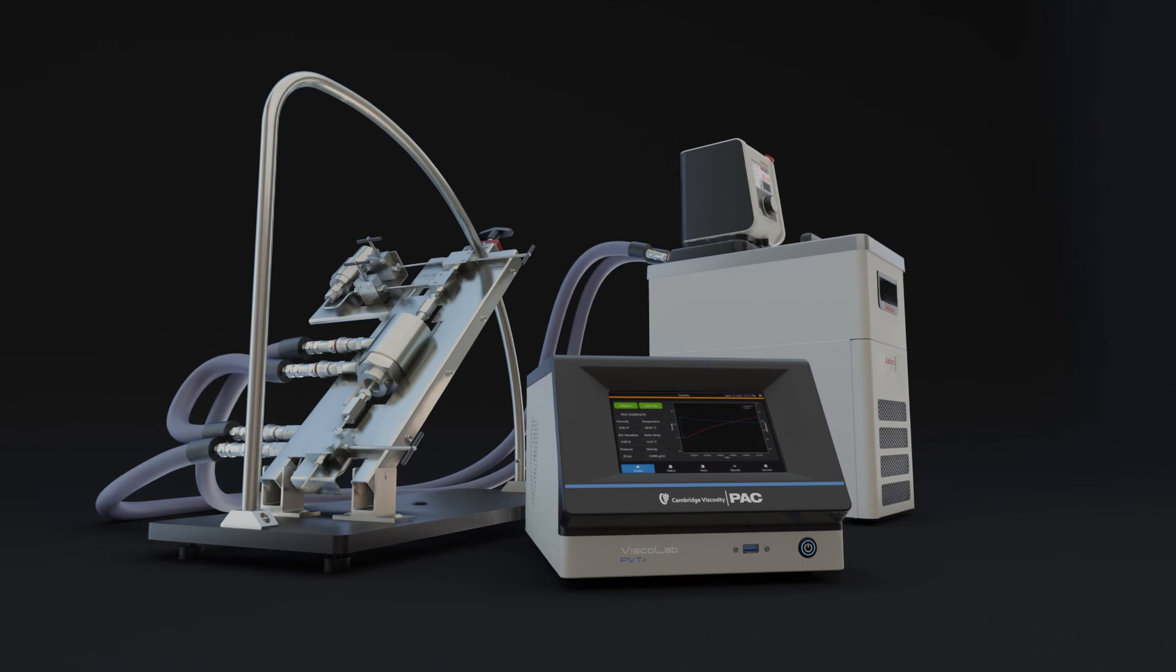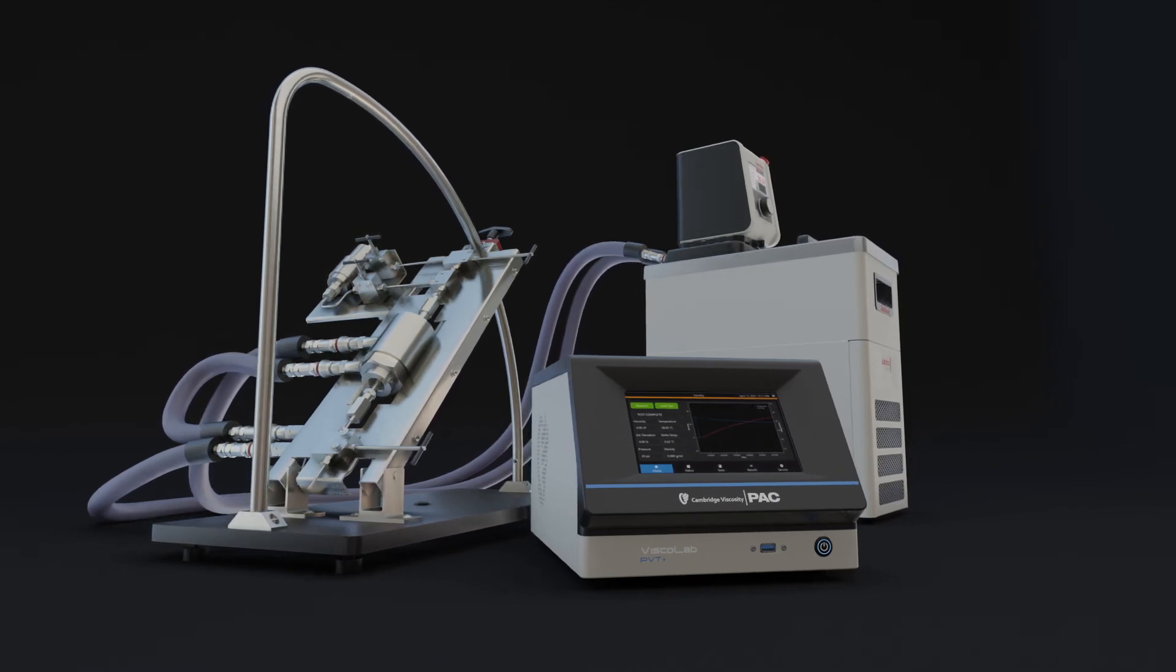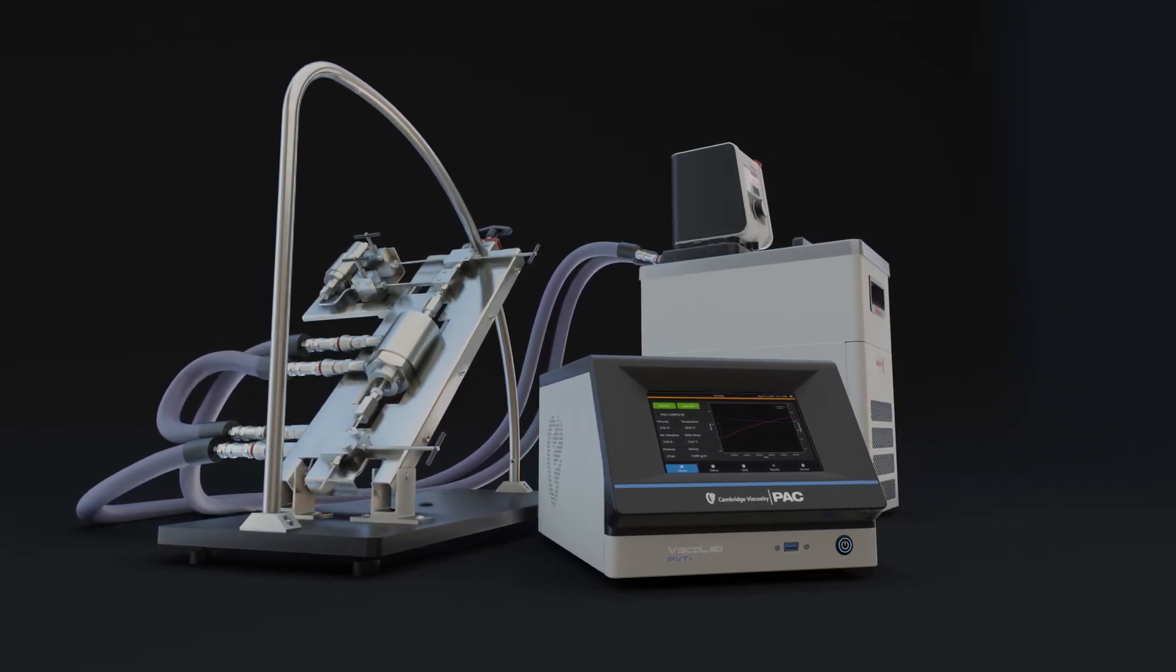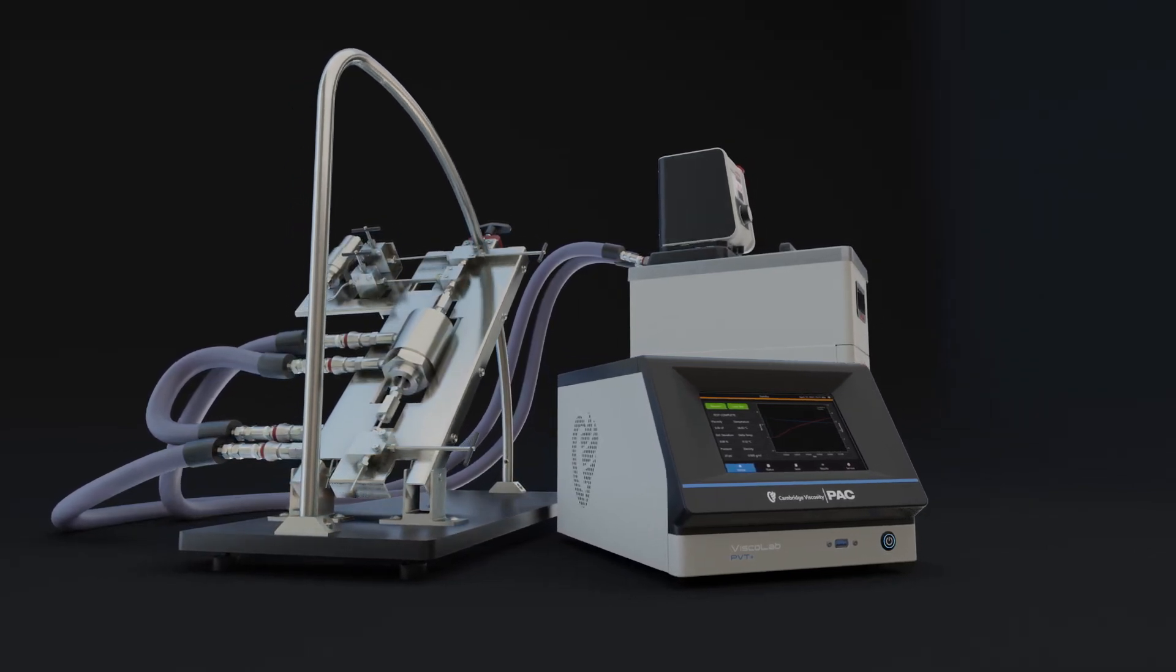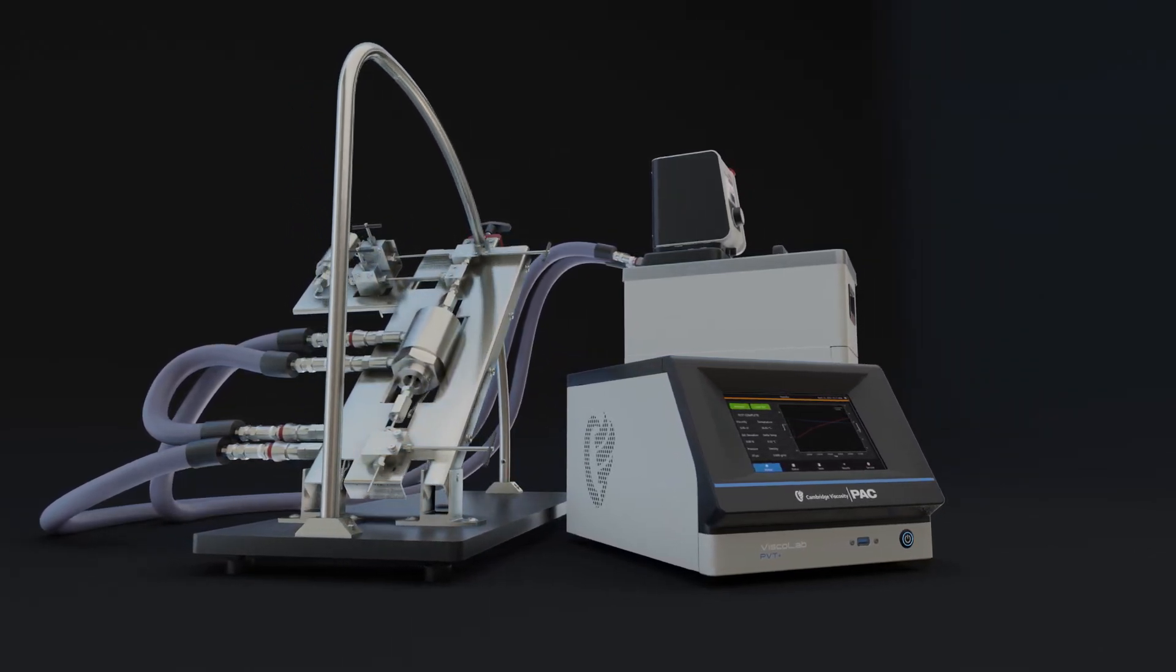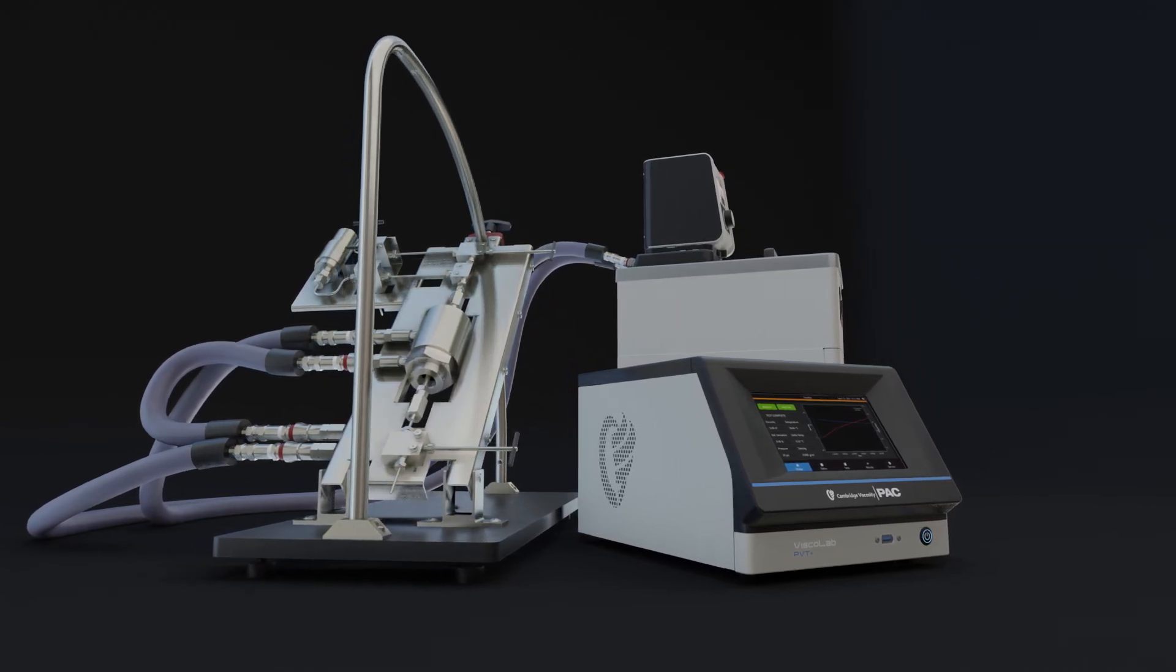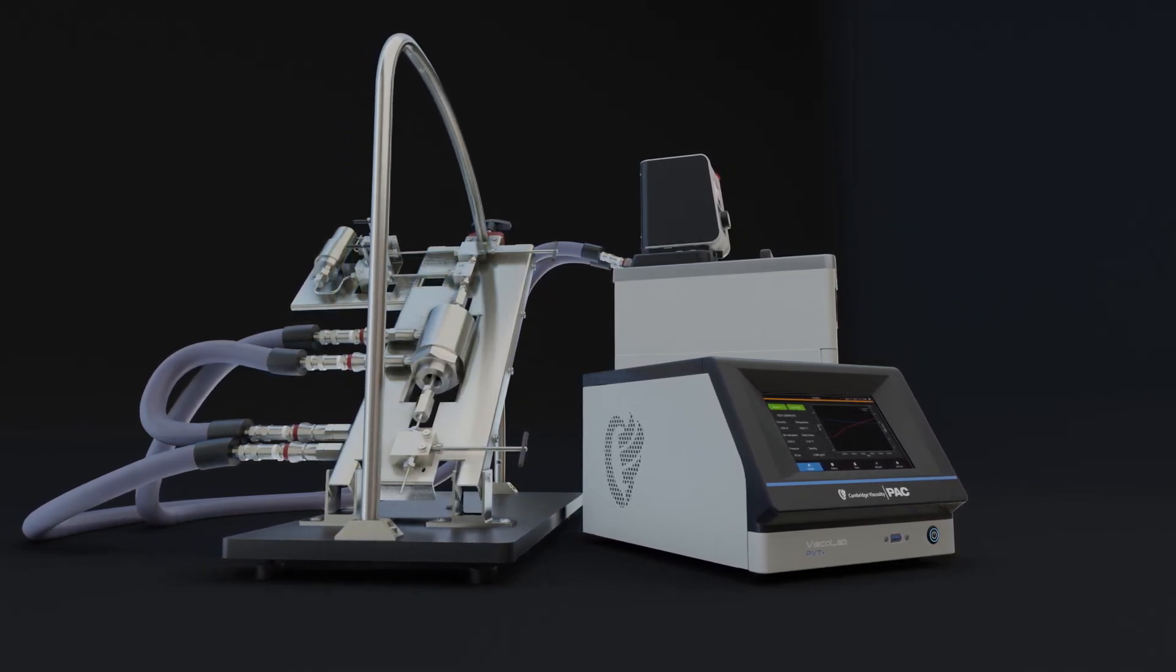Cambridge Viscosity's ViscoLab PVT has been the gold standard in reservoir fluid analysis for over 20 years. The ViscoLab PVT Plus is the new standard for your measurements, providing unparalleled range, accuracy, repeatability and ease of use.